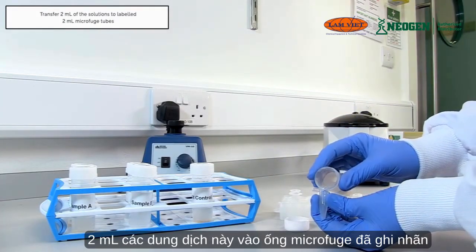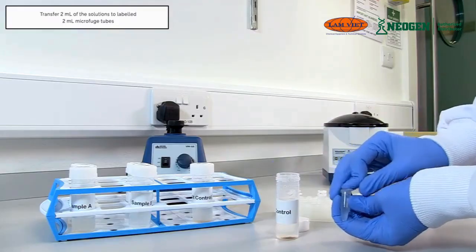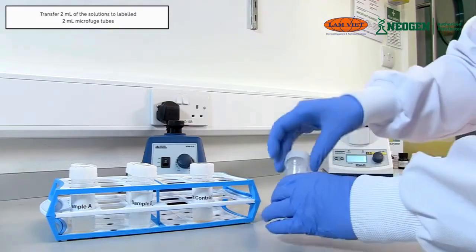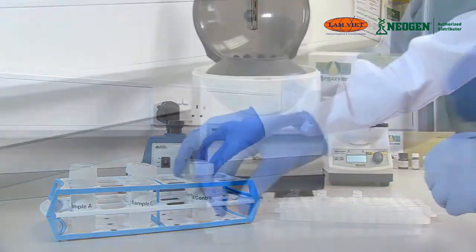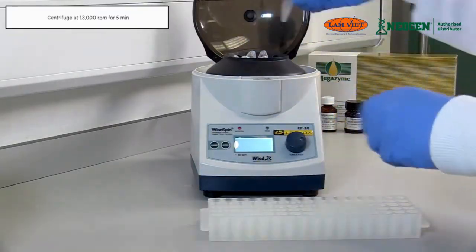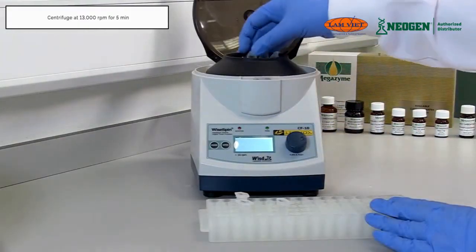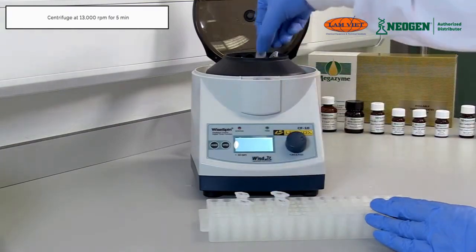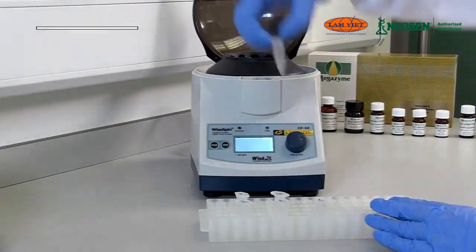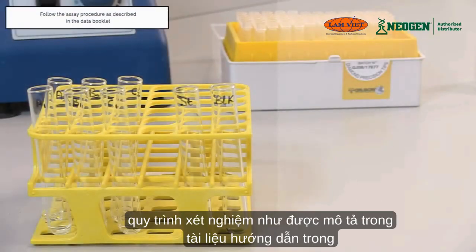Transfer 2 ml of these solutions to labelled microfuge tubes and centrifuge at 13,000 RPM for 5 minutes. Follow the assay procedure as described in the data booklet.